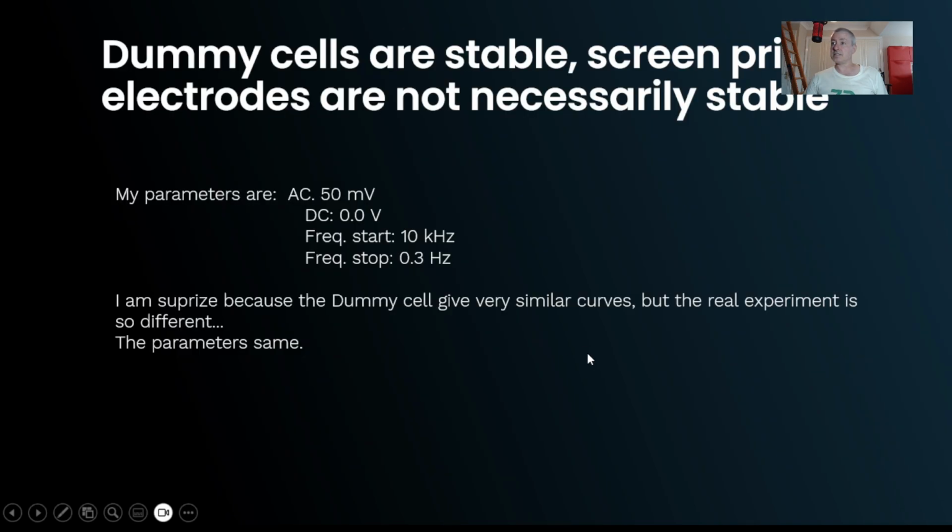With that said, I asked them how they were doing the experiment, and I noticed that they were trying to do what I call a Faradaic EIS. By Faradaic, they've got some ferrocyanide in there, and they're applying a small... no, in fact, they're not applying. They're applying a DC offset of 0 volts, which tells me that they're not really oxidizing or reducing that ferrocyanide. You can't reduce the ferrocyanide anyway because it's already in its reduced state. But they're not oxidizing the ferrocyanide.